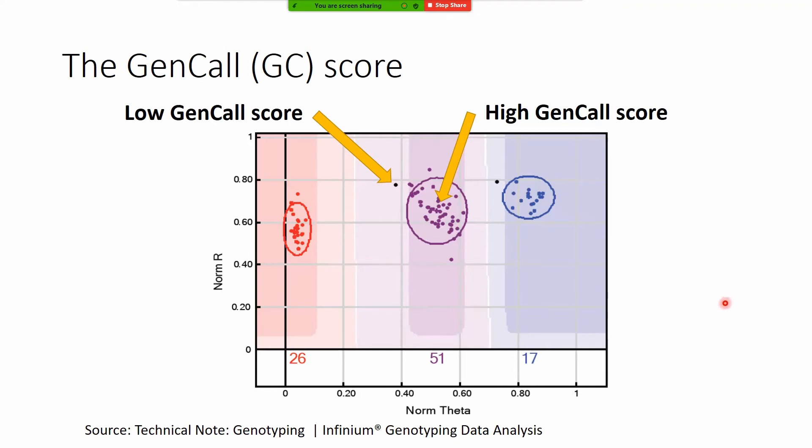But what happens if you want to push quality limits higher than this, for example this animal or individual was called but apparently with a lower GC score because it's further from the center of this oval.